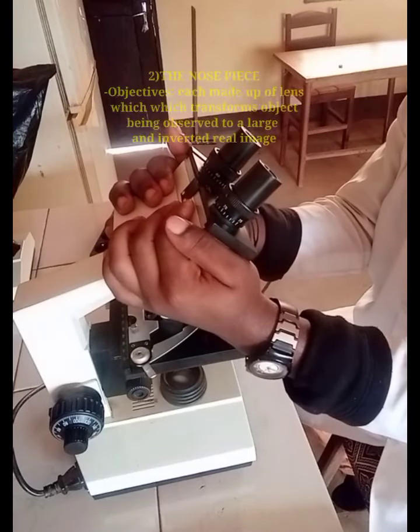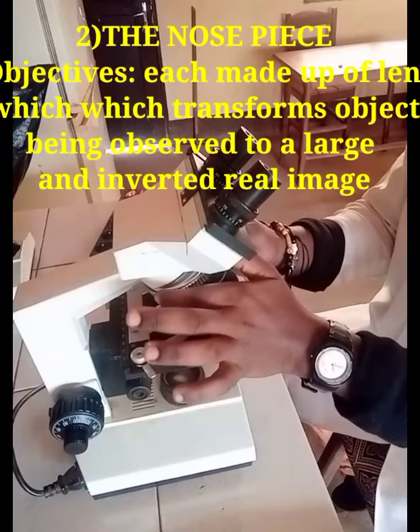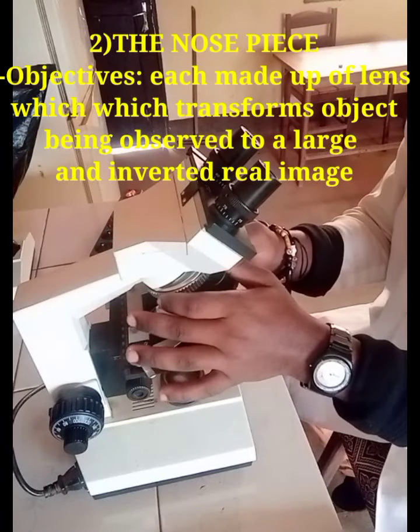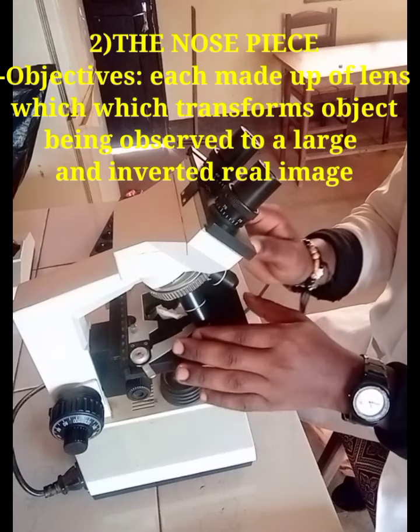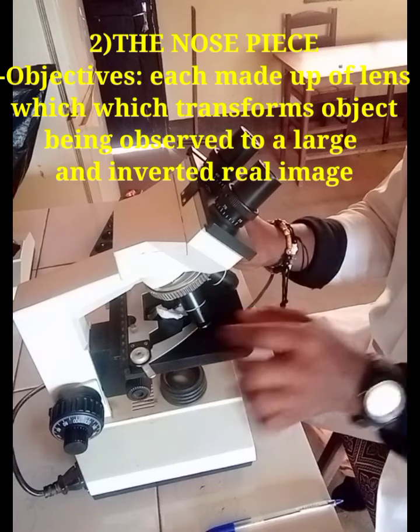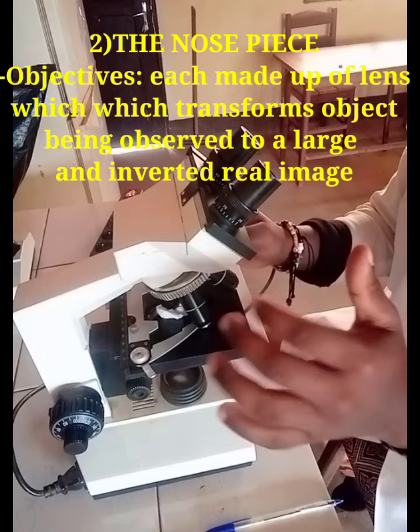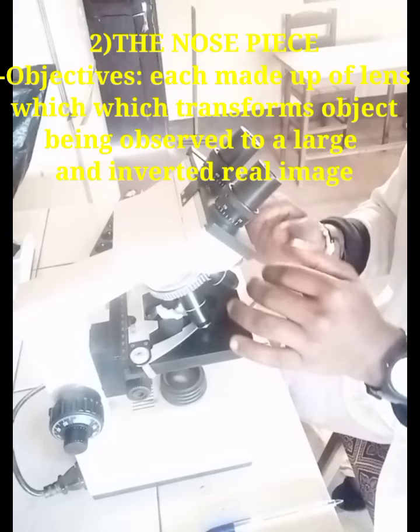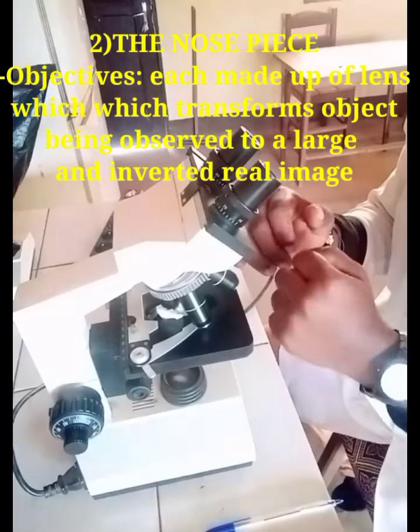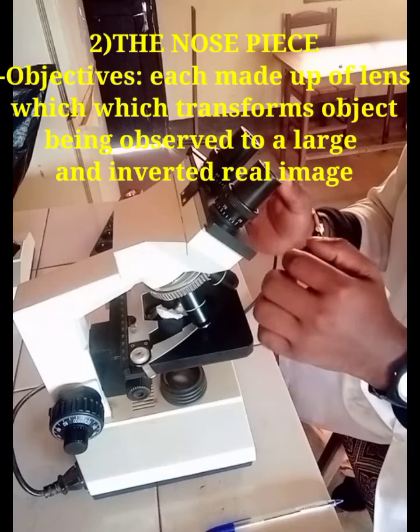Now, after being done with the head, the nose piece. This nose piece is made up of objectives. On this nose piece are attached 4 objectives. Here are the objectives, and these objectives have their values. We have objective 100, we have objective 40, we have objective 4, and we have objective 10.